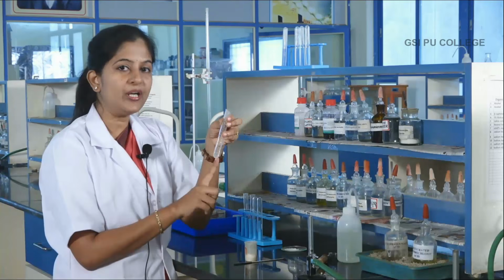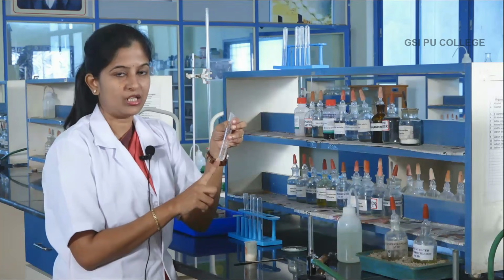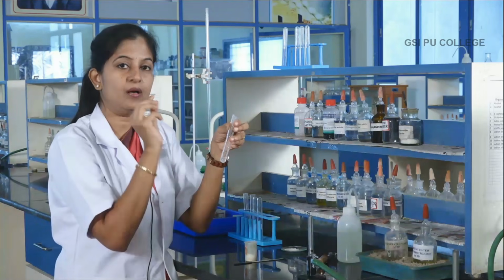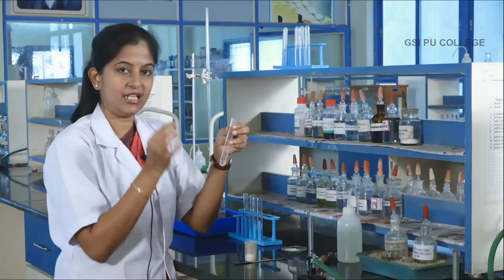Copper needs high temperature and here we use concentrated sulfuric acid, so in order to be safe I am using a paper ball. Take a very small tiny piece of paper, make it into a ball, heat the mixture and add the paper ball, instead of copper turning.